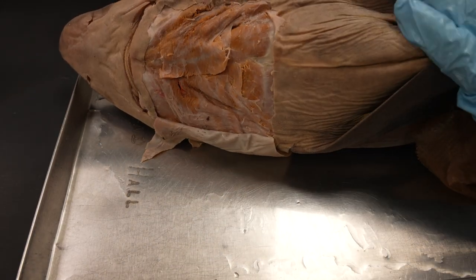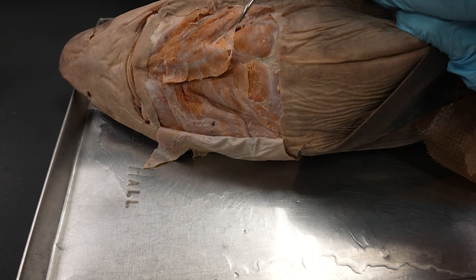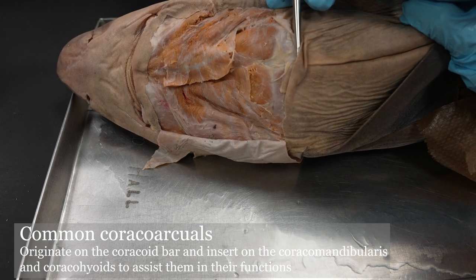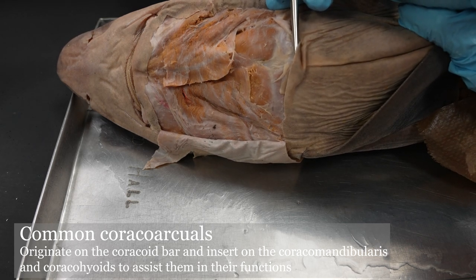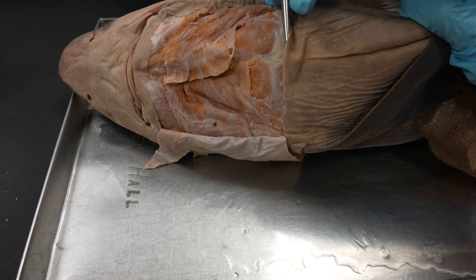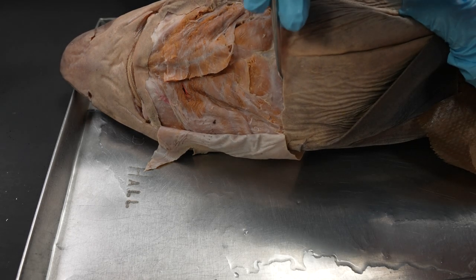Now let's take a look at these two structures. These are the common coracoarcuals — you have to say that a few times and spell it out a few times just to really get a handle on it, because it's kind of an annoying one. Make sure you get the spelling down right because that one can be a little tough. You can sort of see the ventral longitudinal bundle — I didn't really clear it off too much here because we're going to see it on the lateral view, but just so you're aware it is right here.